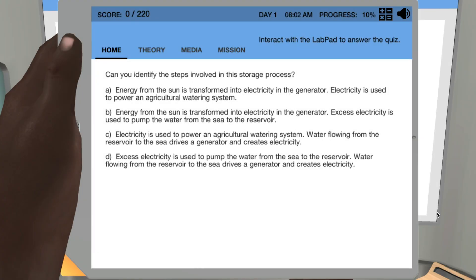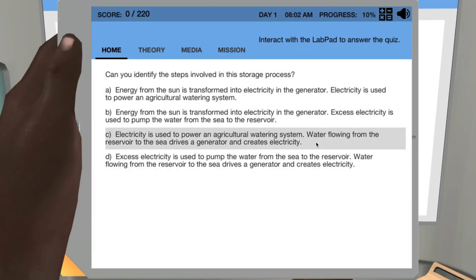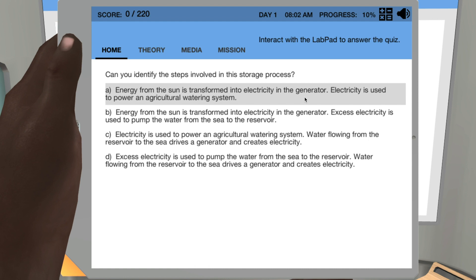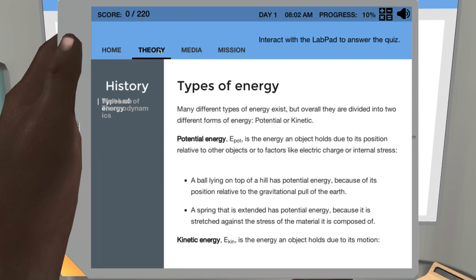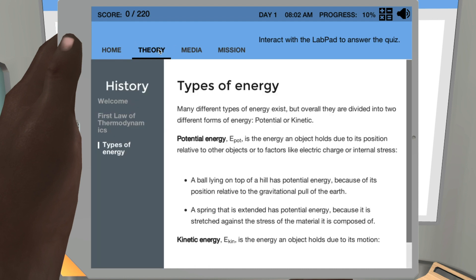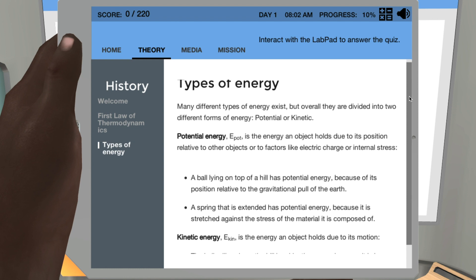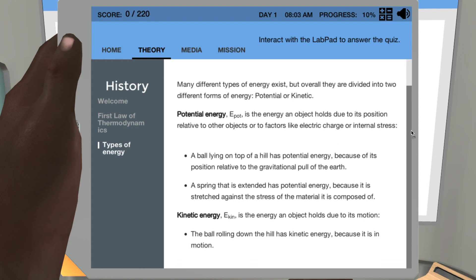Quiz questions test the student's knowledge, also supporting an inquiry-based and deep learning approach. Students also have access to a full theory section, which provides them with relevant background information whenever needed.